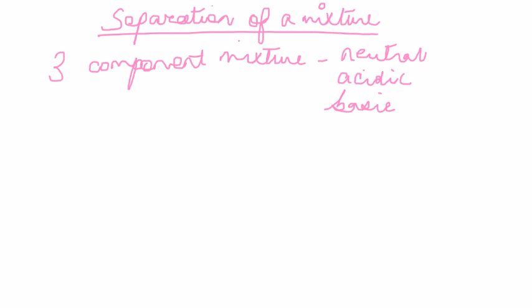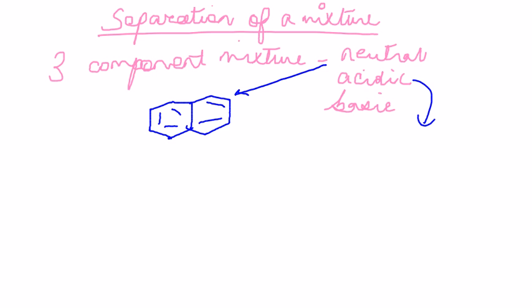So just to give you a flavor for what those compounds are, the neutral compound is naphthalene. The acidic compound is benzoic acid.